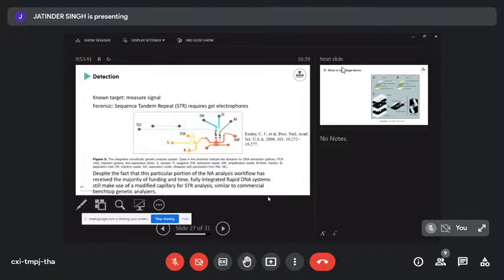We've got the yellow part here, which does the DNA extraction. It has a solid phase packed column in there to do solid phase extraction of DNA. Then we had some fluid handling, with the PCR reagents sitting here. So we've got solid phase extraction, then amplification of our PCR products, then a cross injection here, as we've just talked about with CE. So gel electrophoresis is being done there.